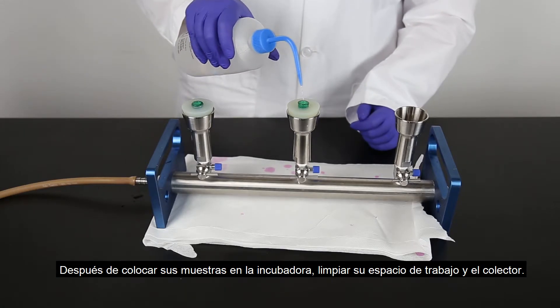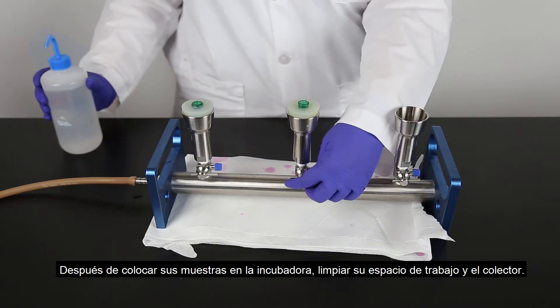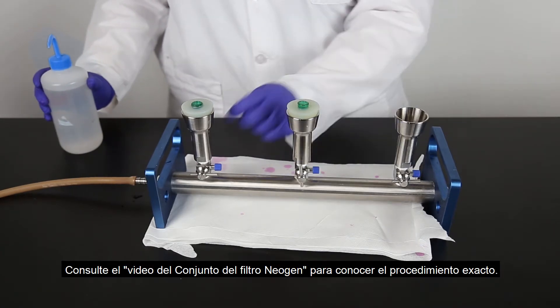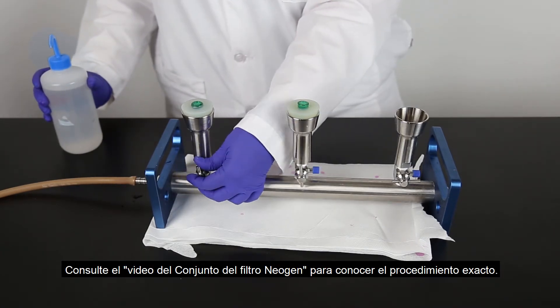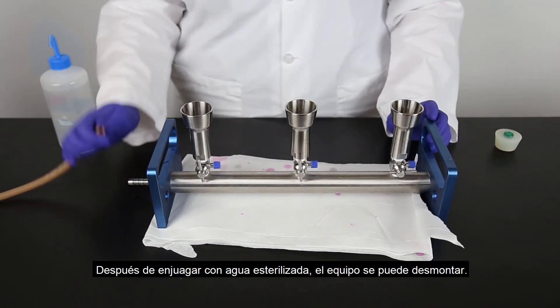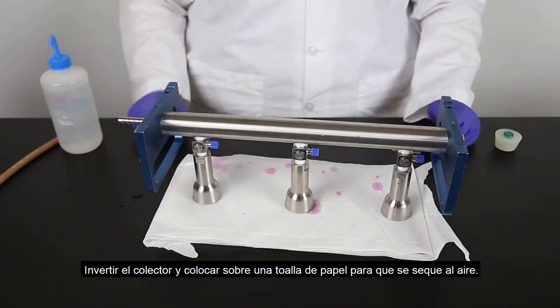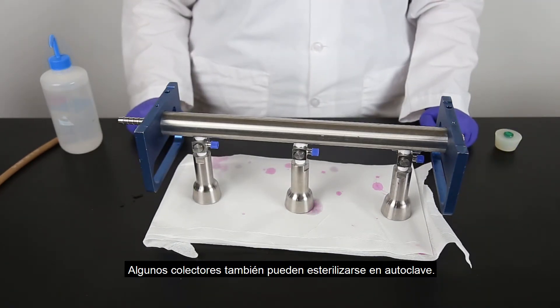After placing your samples in the incubator, clean up your workspace and the manifold. Reference the Neogen Filter Assembly video for the exact procedure. After rinsing with sterile water, the equipment can be disassembled. Invert the manifold and place it on a paper towel to air dry. Some manifolds can be autoclaved for sterility as well.